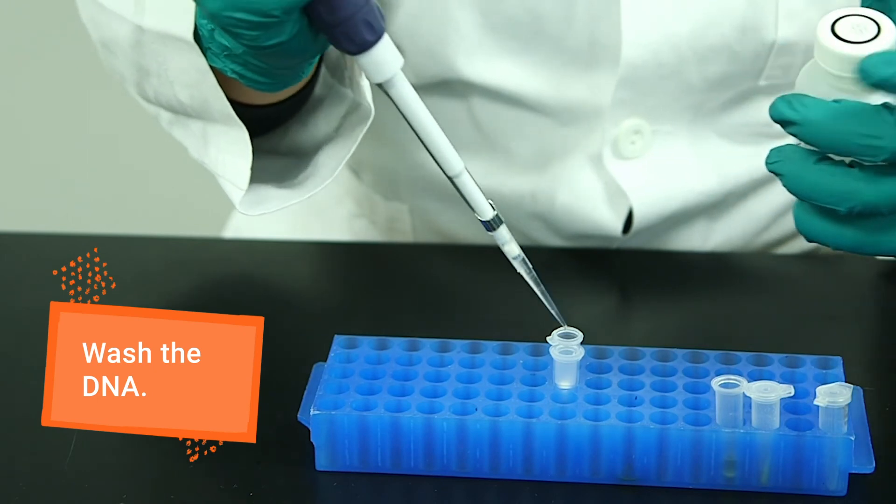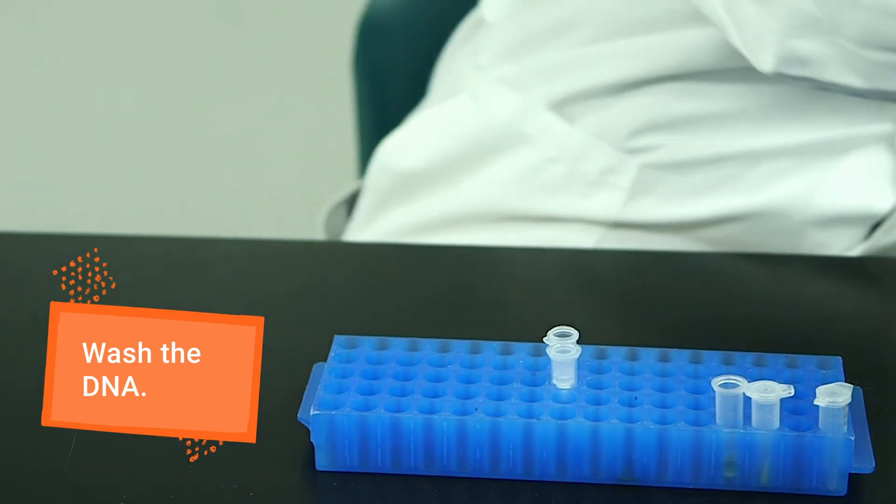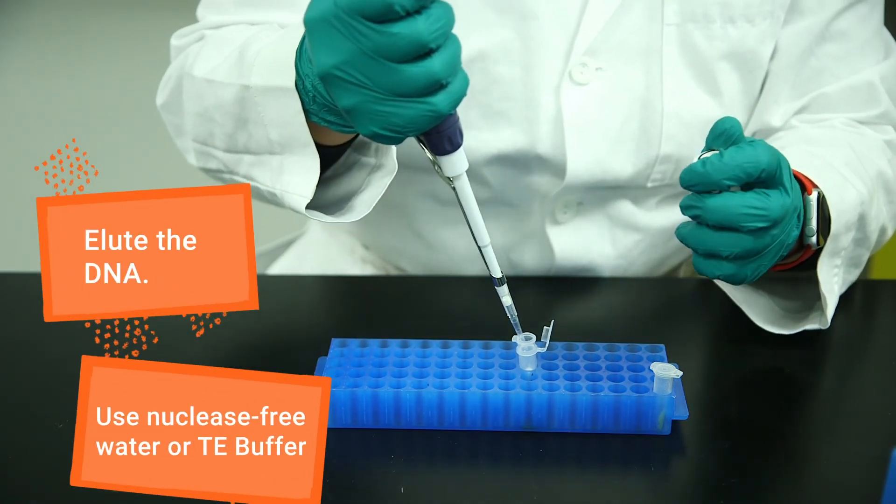Wash the pellet or column with 70% ethanol to remove salts and contaminants, and elute or re-suspend the DNA using water or a neutral buffer such as TE.